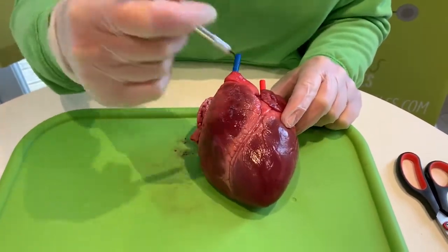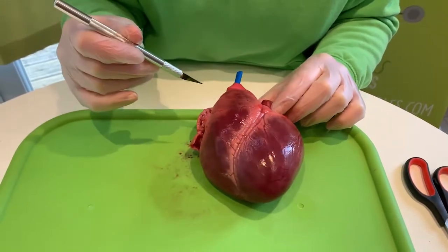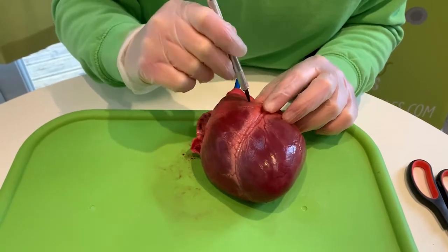So we're going to cut the heart open now, and we're going to have a little look inside. So first, let's go down the right side of the heart, okay? So I'll start up here.